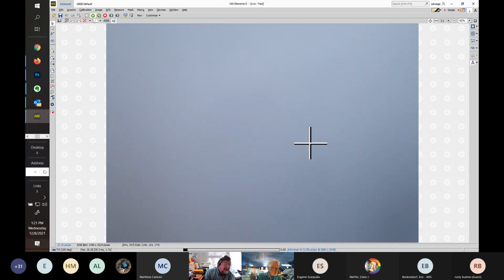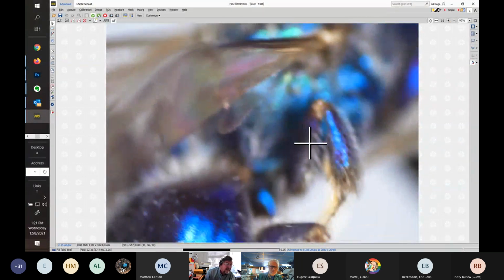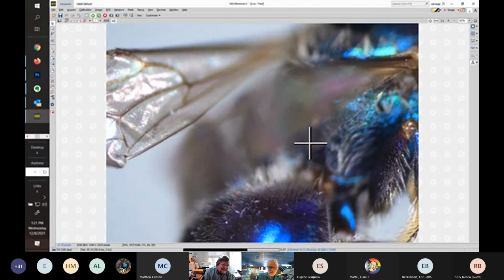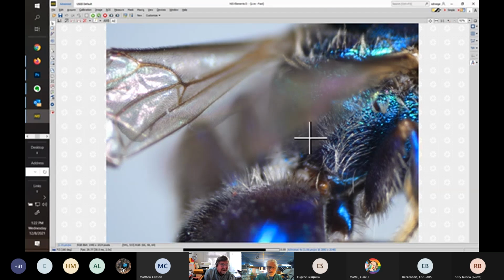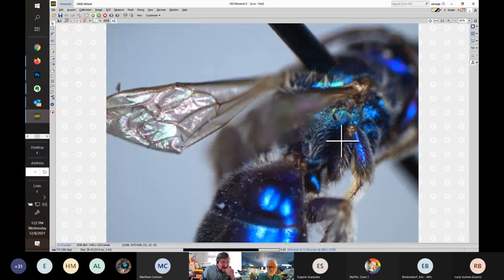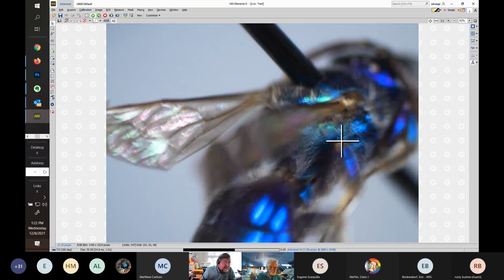Let's see if we can take that. That's always hard to see. I'm not sure if this is going to show up well or not because the wings are in the way, but the idea, I think, is well presented. And that's characteristic of the classic gratiosa. And those ones that come up the coast, I haven't seen enough of those to be very confident about that.